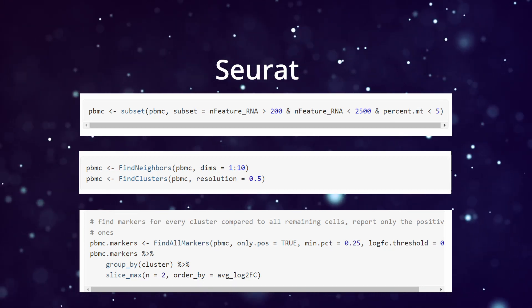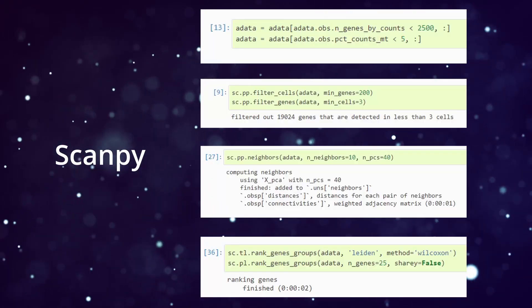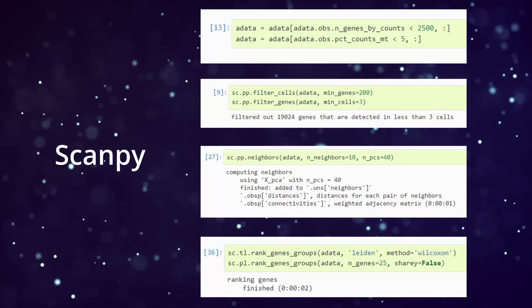The problem is ScanPy and Seurat are actually designed quite differently in certain things. There are some parameters I can set manually — for example, the filtering of cells and features, the task for finding markers I set both to Wilcoxon, and the number of neighbors in UMAP. But there are certain things that are designed differently that I can't and don't think I should change, because I try to maintain all my code based on official instructions in order to preserve the recommendations the authors give us — otherwise it might not seem fair. For people interested in the benchmark and how it is run, you can take a look in the video description down below.